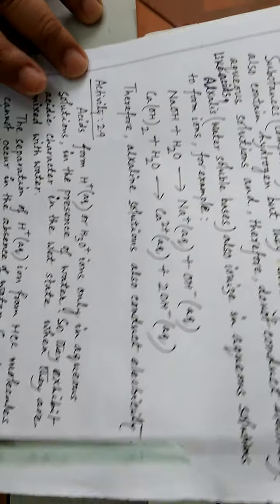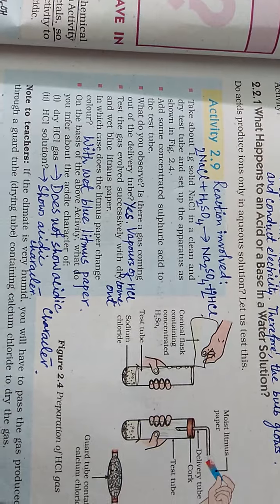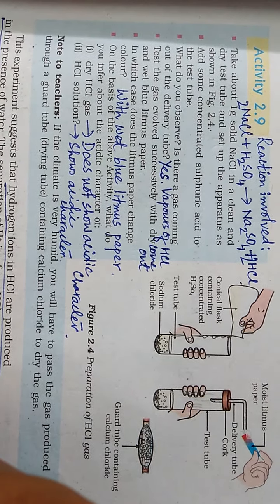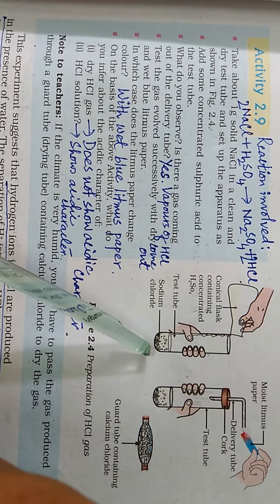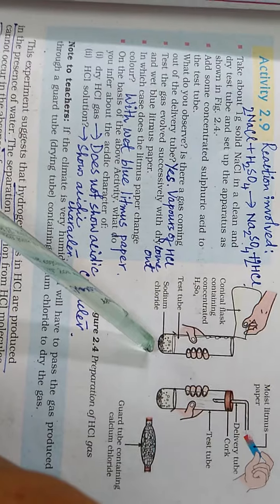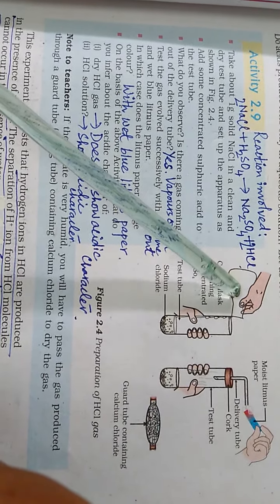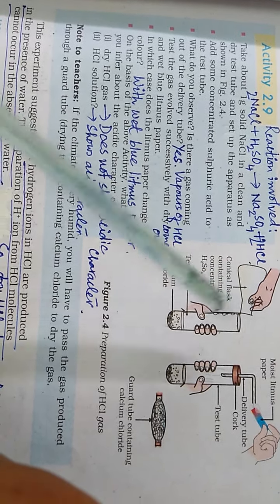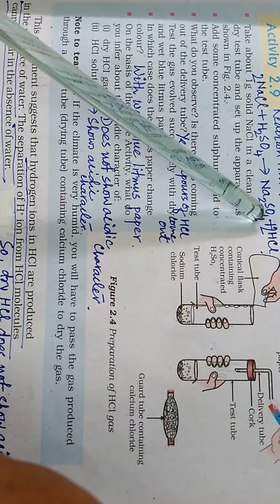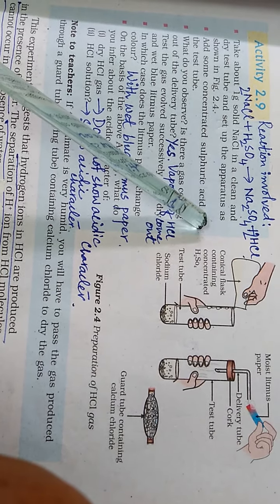Now, we will do activity 2.9, in which we take about 1 gram of solid sodium chloride in a clean dry test tube and set up the apparatus as shown in this figure 2.4. We add concentrated sulfuric acid to the test tube. The reaction which occurs in the test tube is this, in which hydrochloric acid forms vapors.